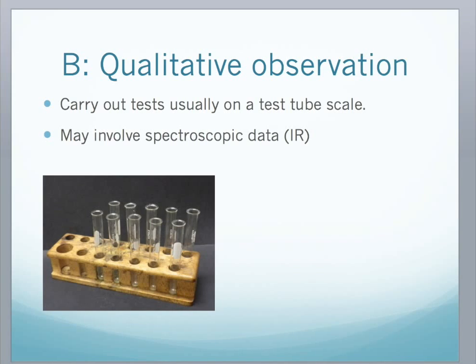So most of the time you'll be asked to mix the reagents and then to record any color changes. Remember, sometimes you can have a precipitate forming, so make sure you notice that, and also some of the precipitates can be colored, so make sure you write down the color.